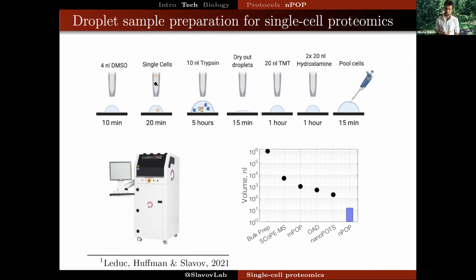And this dispensing is much gentler compared to FACS sorting. So that's where the advantage for our CZI project came in. The FACS sorting that previously resulted in mostly getting cell debris was now replaced with this gentler method that allowed us to recover more proteins for protein analysis. And then the proteins are digested with trypsin while everything is happening inside of this instrument in parallel for all of the droplets, all of the single cells. They're labeled, barcoded, and pooled together. So this approach allows us not only to automate the sample preparation for lots of cells in parallel, but also to reduce volumes below what was previously possible.